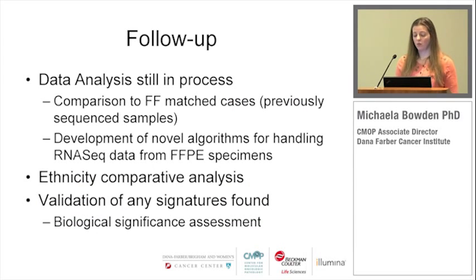The follow-up on this is, for this same cohort, we have frozen matched cases which were previously sequenced, and our bioinformatics team is looking at the fresh frozen as a benchmark of what is absolutely available and known in these samples, using traditional pipelines and tools that have been developed, and then looking at what's lost in the FFPE samples and trying to figure out: can you close the gap? There's always going to be a gap. But in most cases, you're not going to have frozen material, so maybe that's the only material that you have, and you have all these years and decades of clinical information available for these patients, so it's an important point to try and close that gap so that you get as much as you can out of them.